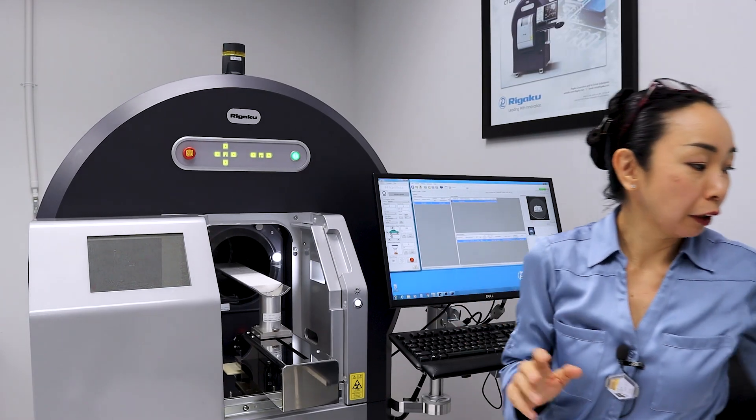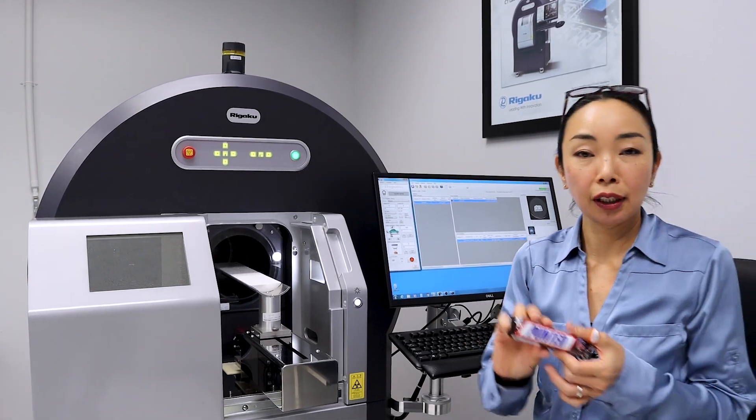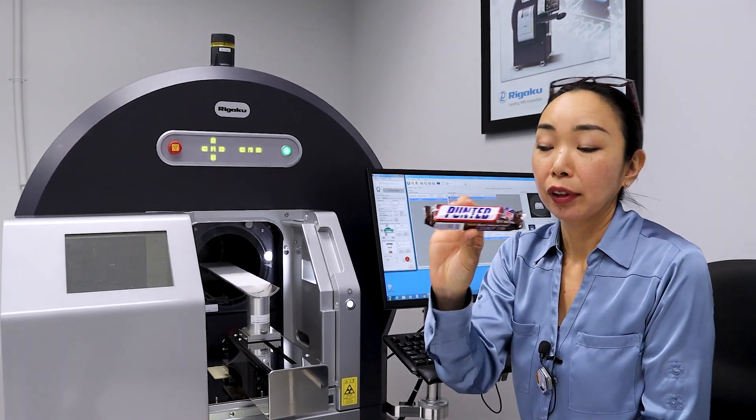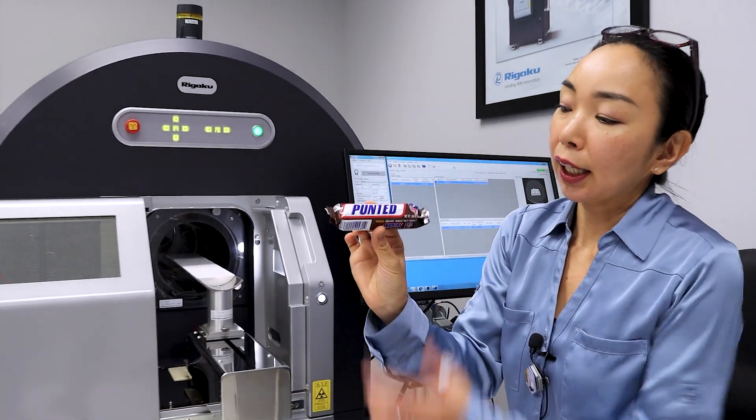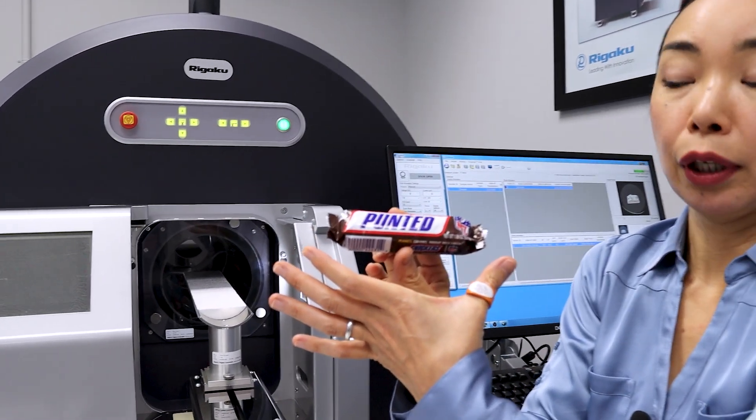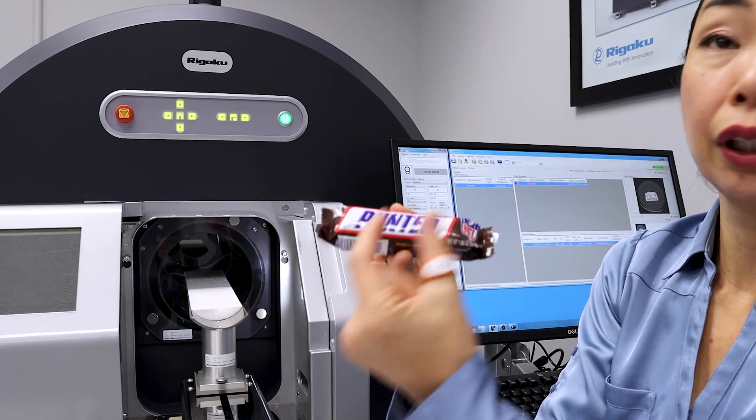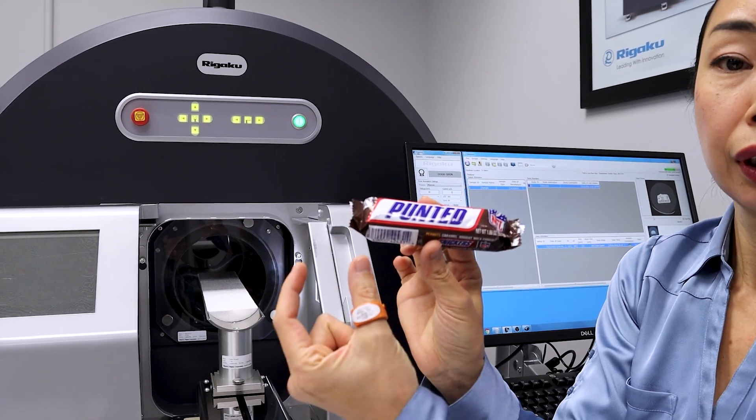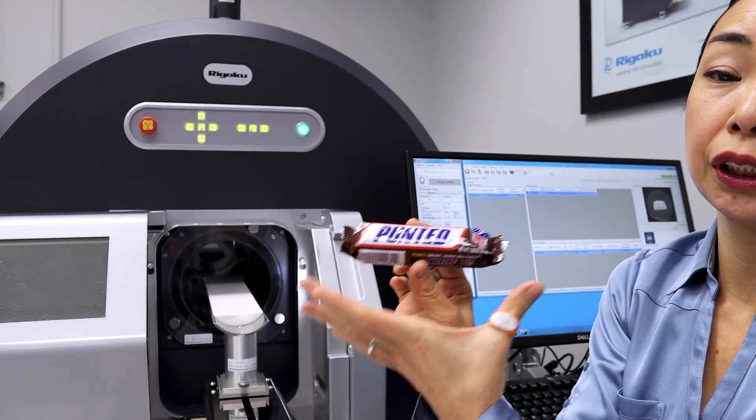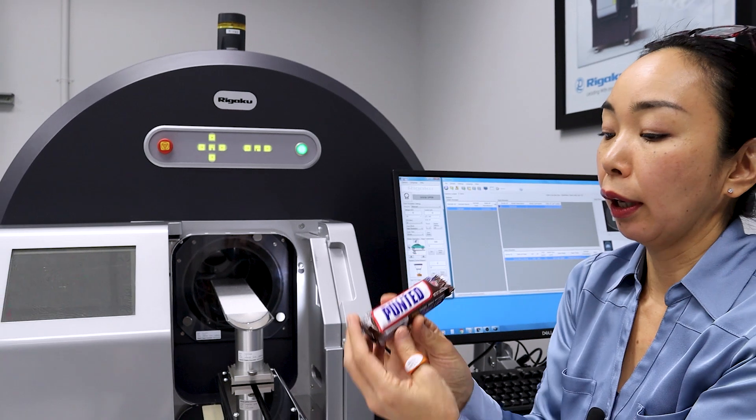You can scan many different things on this machine, but let's take a look at this chocolate candy. This is a kind of long sample, but we can scan this in three sections and connect them all together to see the entire sample.